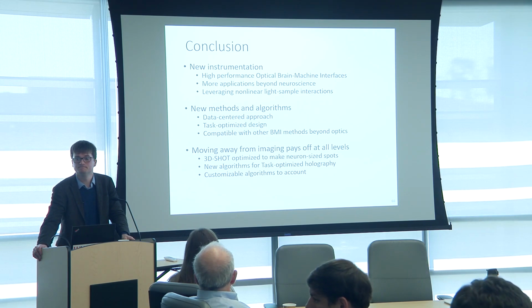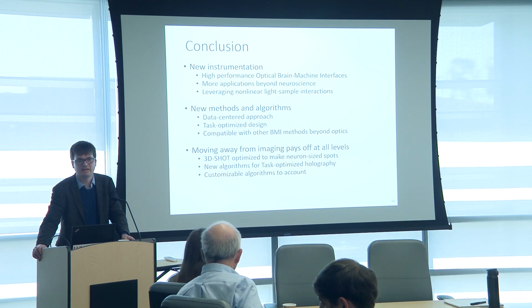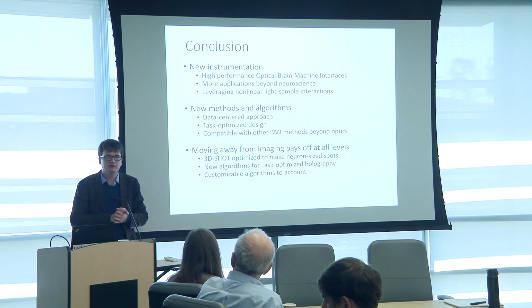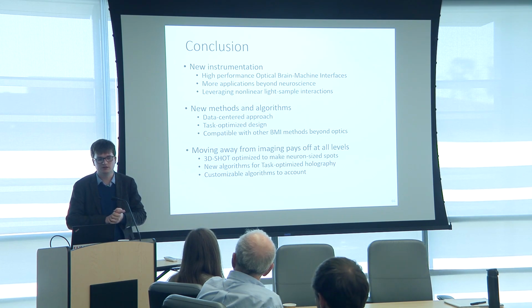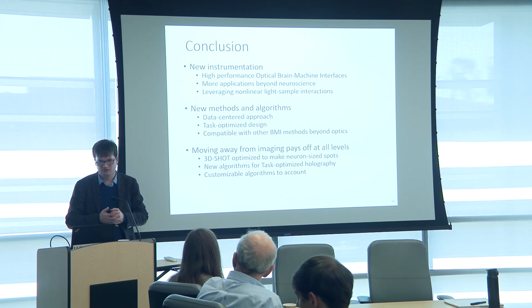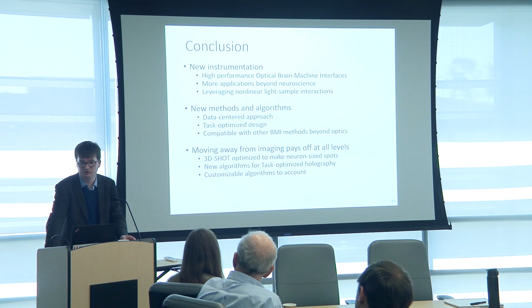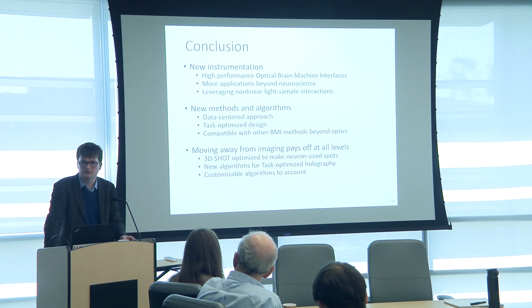What's the typical laser power you use, and do you also have dispersion compensation? Excellent question. Typical laser power: I think the techniques that were published were used with an 18 watt femtosecond laser, typically around megahertz repetition rates. This is all in the paper. We also had a 40 watt 1040 nanometer laser, again 1 or 2 megahertz depending on the settings. You want extremely large pulse energy because you're going to divide your energy across multiple targets. And the pulses are on the order of 200, 300 femtoseconds.